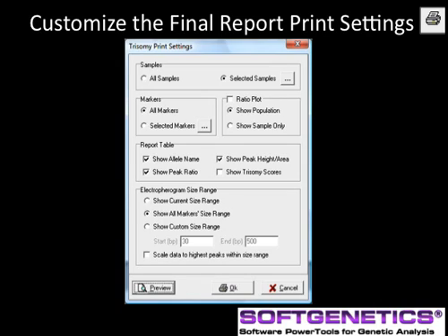After reviewing the trisomy analysis results, select the printer icon to customize the final report. Options include printing all or selected samples and markers. Ratio plot is selected if a second page with the ratio plots for the entire project is desired. Report table content and electropherogram size range are options to allow customization of the final report. Print directly from this screen with the printer icon, or print and save from the print preview display.